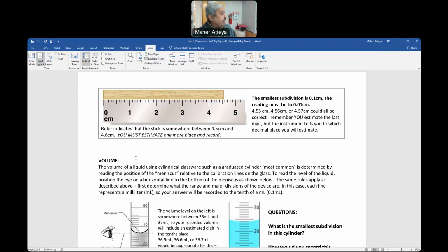And as you will see, there will always be a problem to estimate the last digit of the value you are reading. The first ones are easy, straightforward, exact numbers, you can see them, but the estimation of the value at the last digit will be a little bit different from person to person. And that's part of the error inside the experiment itself.